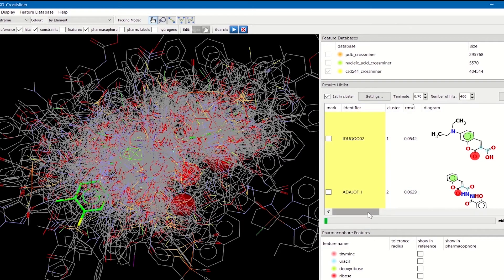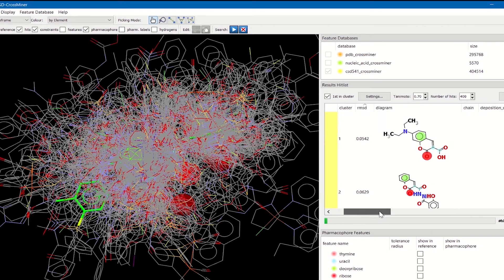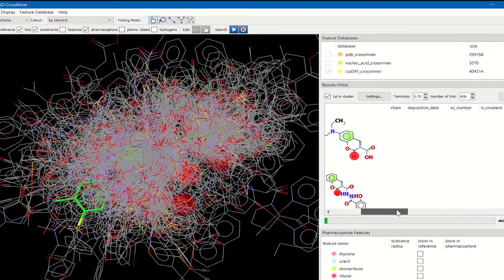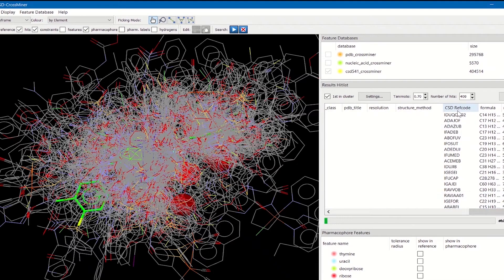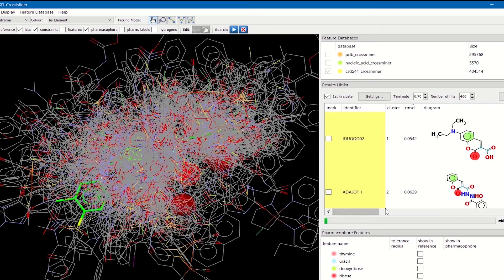Each entry in the CrossMiner database comes annotated with different information characterizing the entry — for example the chain, the deposition date, or the EC number for PDB entries. Scrolling down the list you can also see specific annotations for CSD structures, such as the CSD ref code, the formula, and the R factor. All these annotations can also be used as a filter using the annotation filter available at the bottom of the pharmacophore feature window.